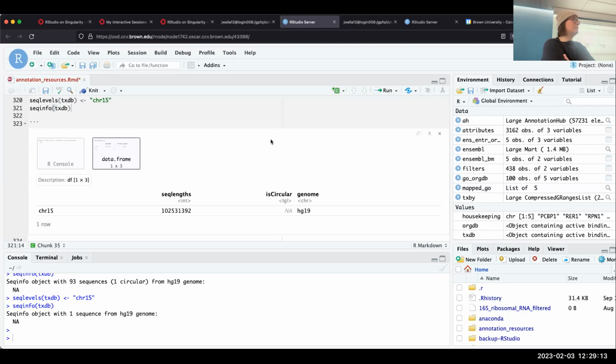Maybe you covered this already, but it seems like AnnotationHub combines a lot of different sources, and you showed the different styles you can switch between, like UCSC or the other ones, NCBI. I'm wondering, when you import from these multiple sources, do you ever run into issues of having duplicate genes, where one database says there are two genes but they're really the same?